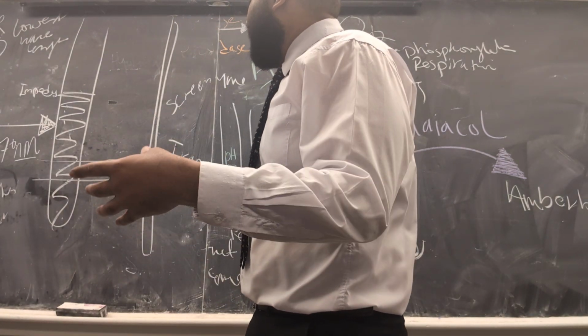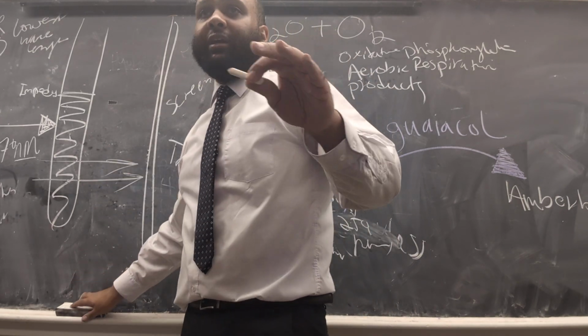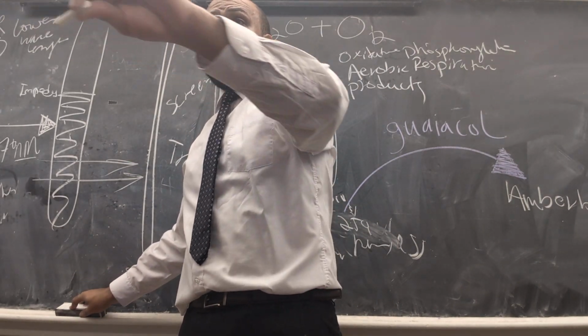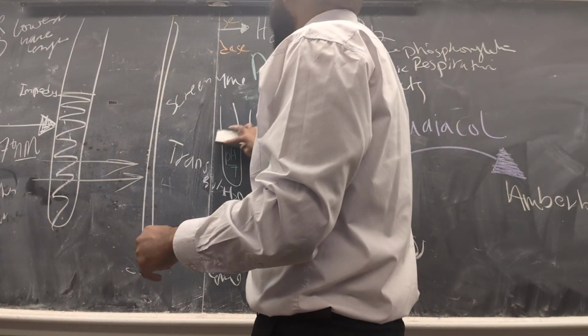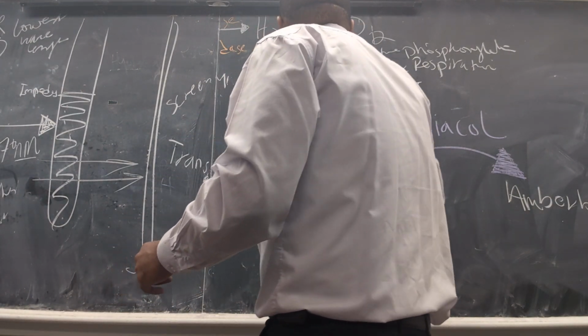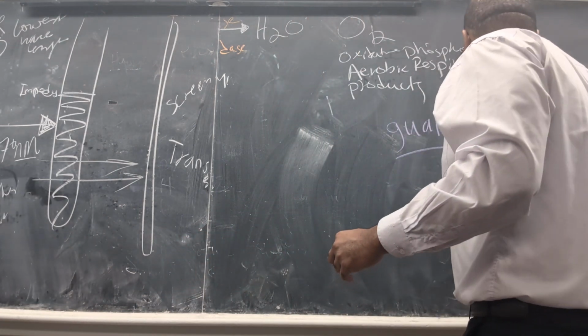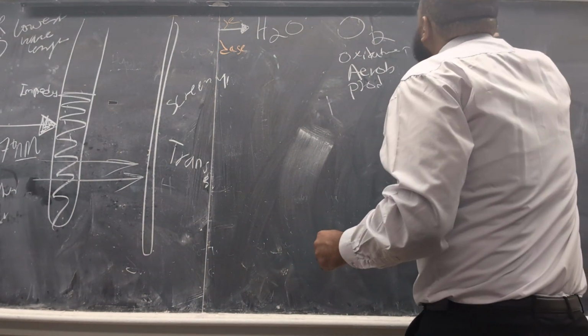I don't want to take time from the experiment, but you have to understand that after we add all of our reagents, we're going to be putting them in the spectrophotometer, looking for both how much light passed through and how much light was absorbed. How much light passed through, how much light was absorbed. And our hypothesis, we have a null hypothesis.